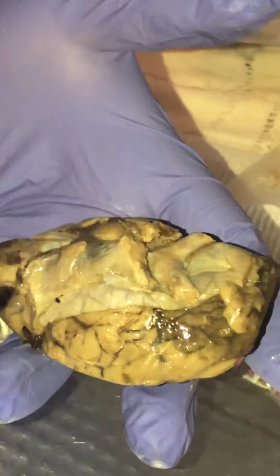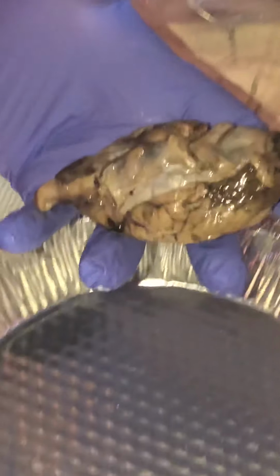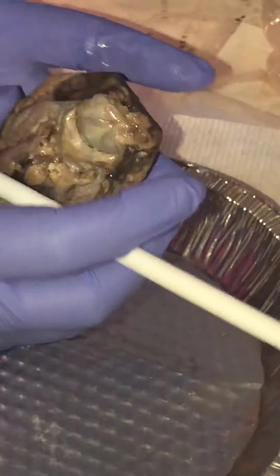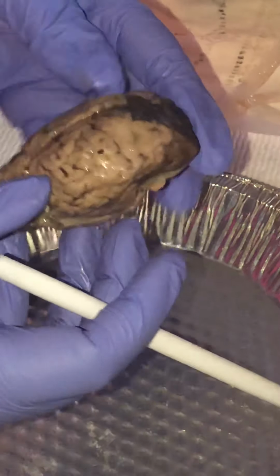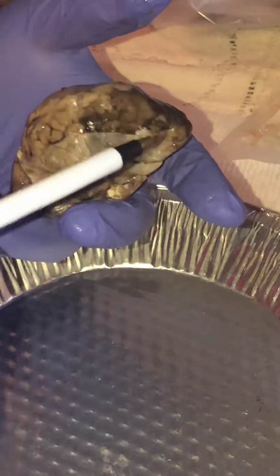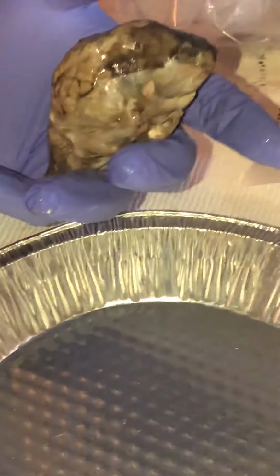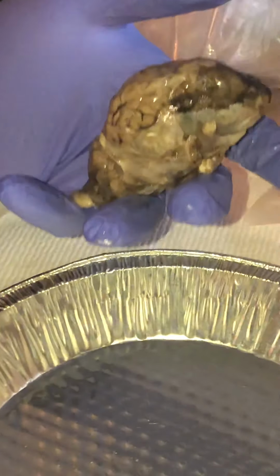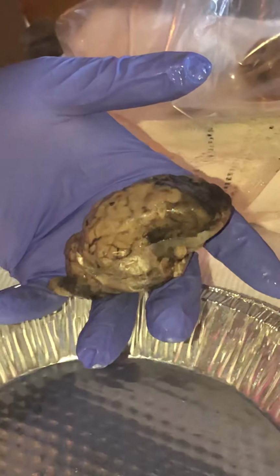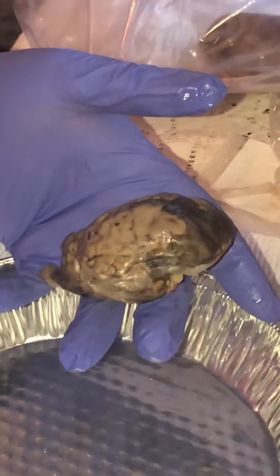Okay? And then going on, I'm trying to keep count here. So that was two. Then we have the frontal lobe, the left and right frontal lobe, which is right here, which is perception, personality, judgment.